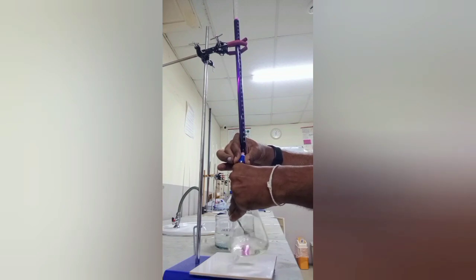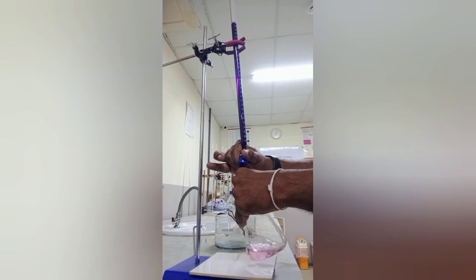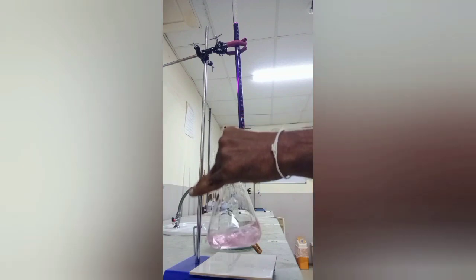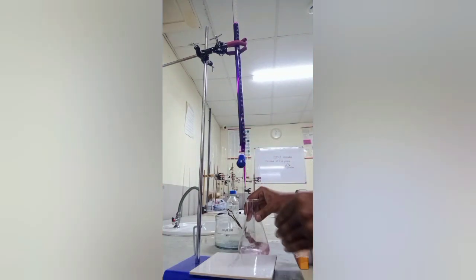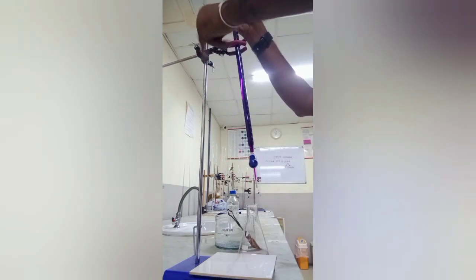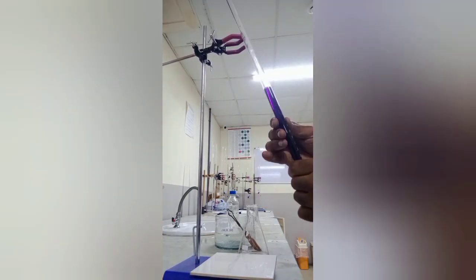When the color is intense, go a little bit slow to get the endpoint. Okay, we got that. Suddenly you want to stop it. This is the appearance of the pale permanent pink color. Once you get this, stop and note the reading. See that with the white tile it will be very clear. Take it out and note the reading.